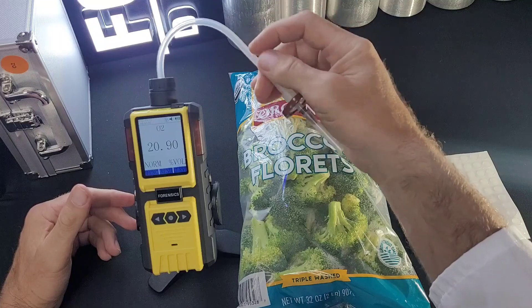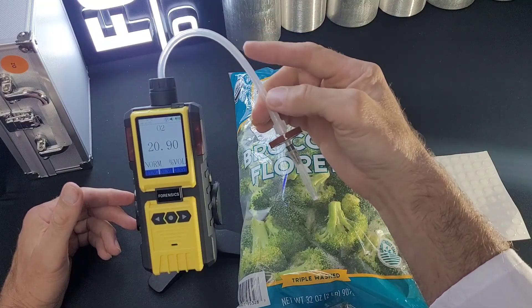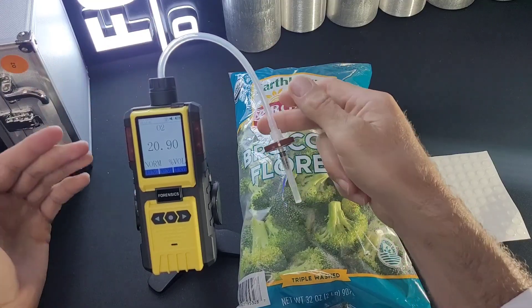The Headspace Analyzer comes with two sets of filter and needle setups. There is your silicon-grade tubing that draws the air into the unit. That's the basic setup.